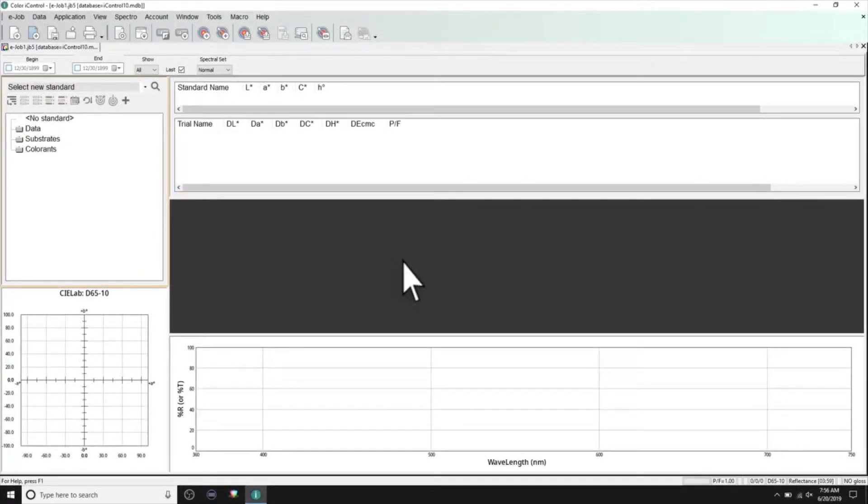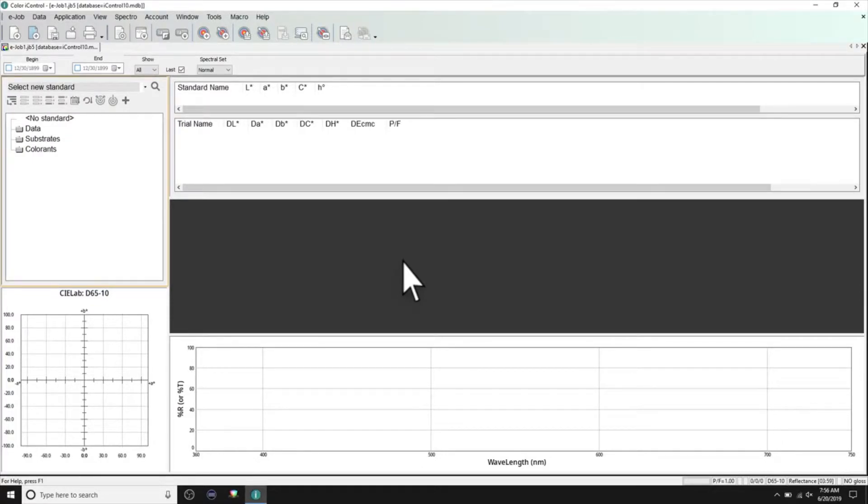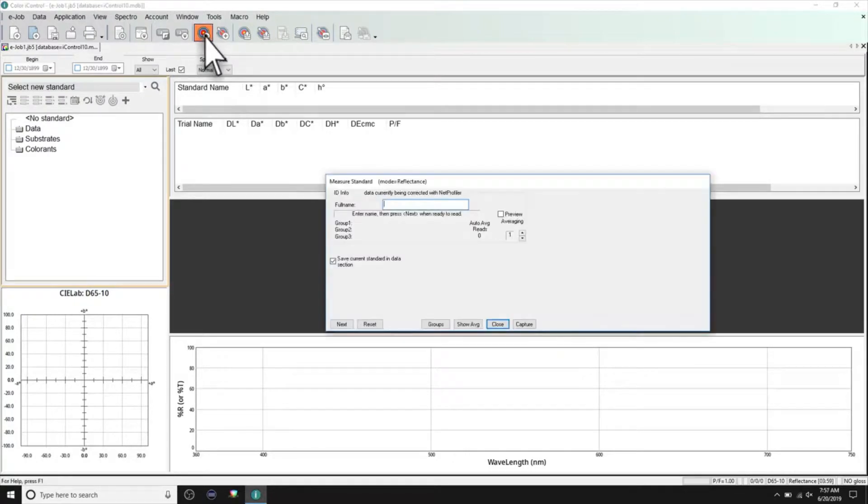Before taking measurements, ensure that the correct configuration is loaded and calibrated. Once ready, initiate a standard or trial measurement through your software.